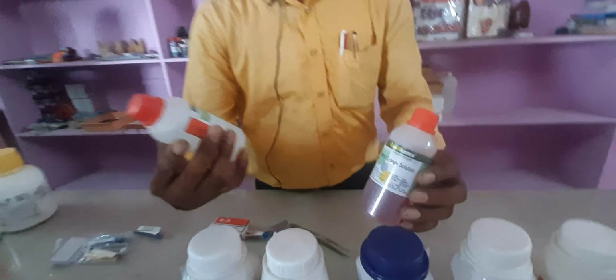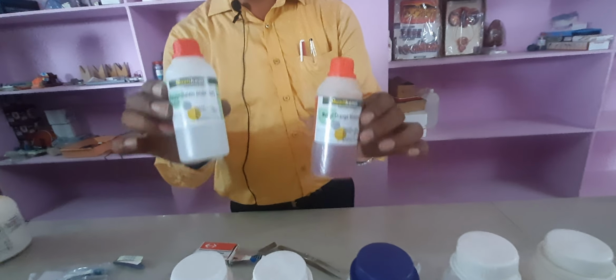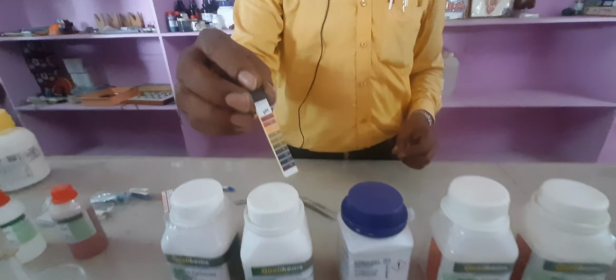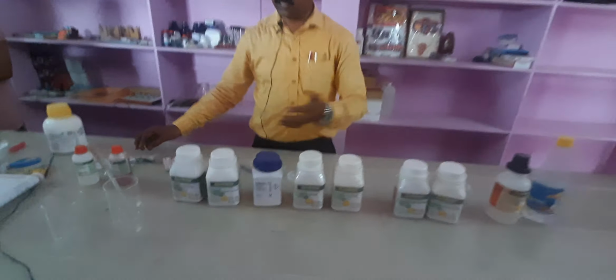Another two indicators are there. These are synthetic indicators, phenolphthalein and methyl orange. This litmus paper is a natural indicator. This is the universal indicator, with pH values from 1 to 14. So these are the acids, bases and salts.